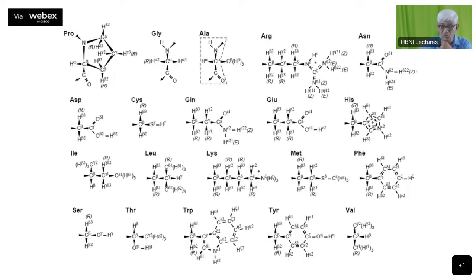And arginine goes all the way from C beta, C gamma. I'm not writing the C alpha in these, okay? C beta, C gamma, C delta, N epsilon, and it has this other NH2 group here and the CNH. This is a guanidine structure group. Then you have the asparagine, as I said, it has the CONH2, and this goes up to the beta and the gamma. This NH2, you will see the implications of that in the HSQC spectra later on.